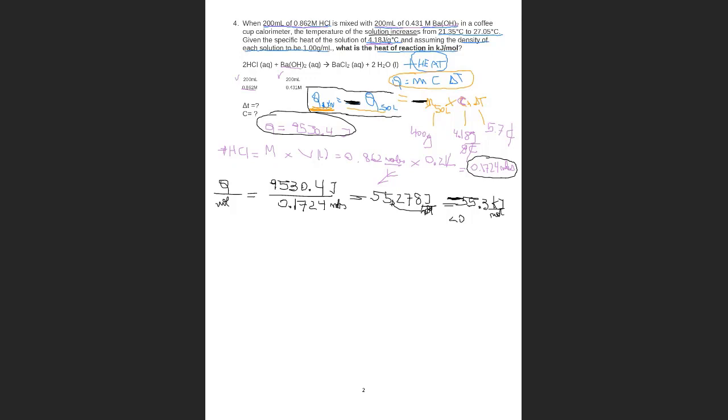What is important, I would say, is to know that the heat of the reaction, which is the mixture of the acid and the base, is released to the solution. You can think of water. When the solids mix, they release to the water, and they have opposite signs.